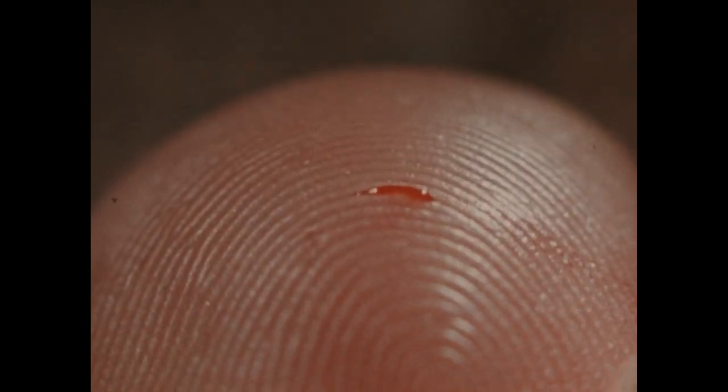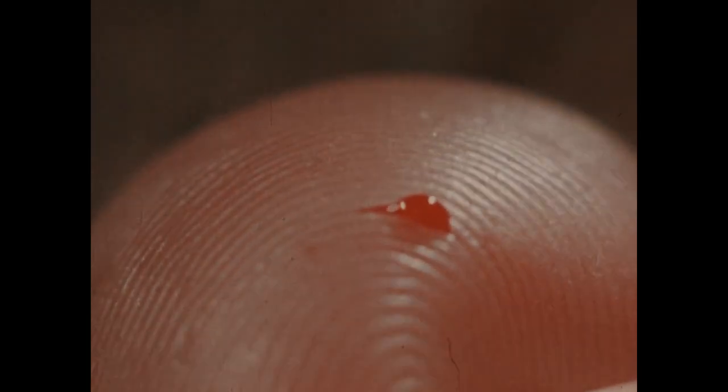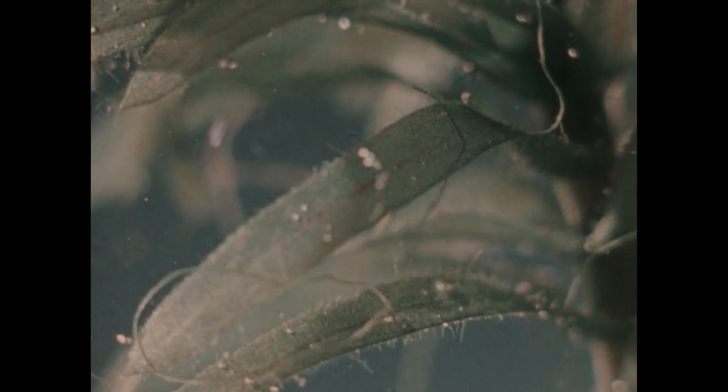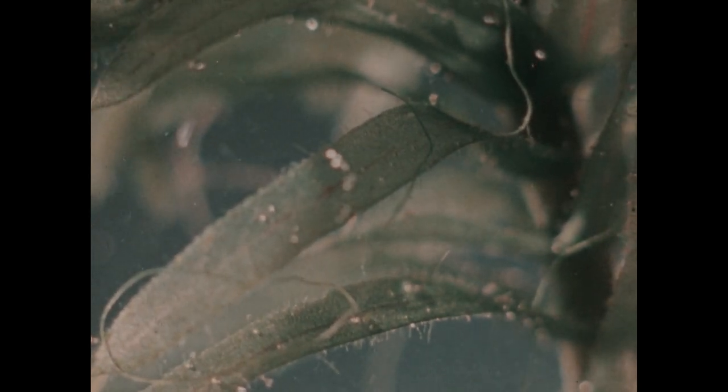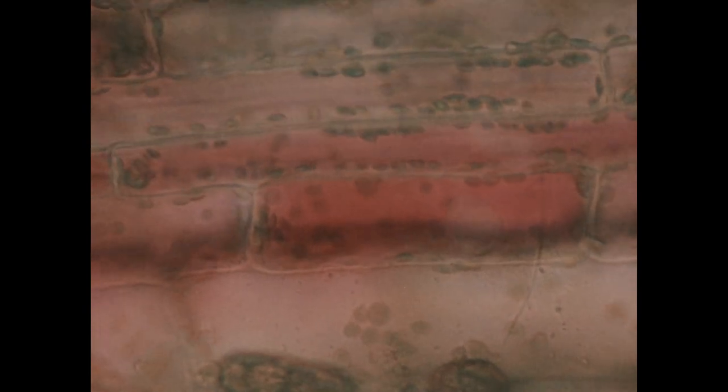The substance, blood, appears to be a uniform red liquid. It is, in fact, a clear fluid filled with tiny cells. All living things, when enlarged, show new levels of structure, from leaf to cells to the tiny living particles they contain.